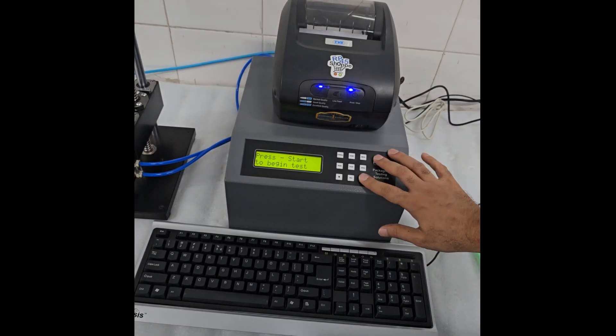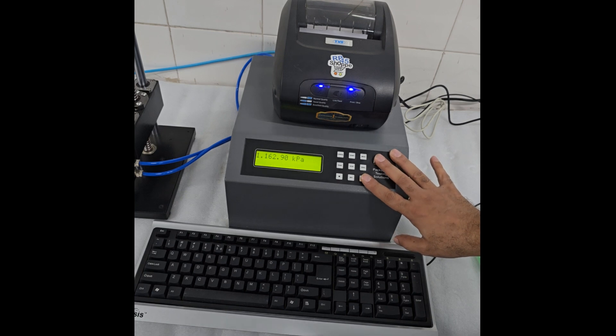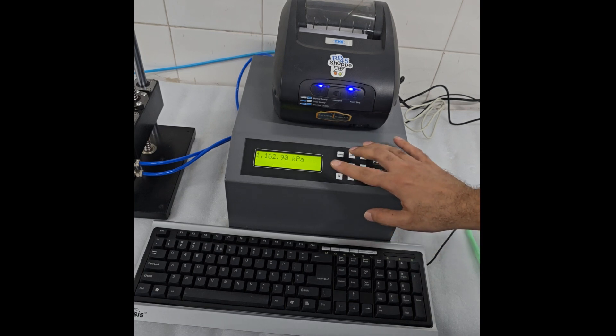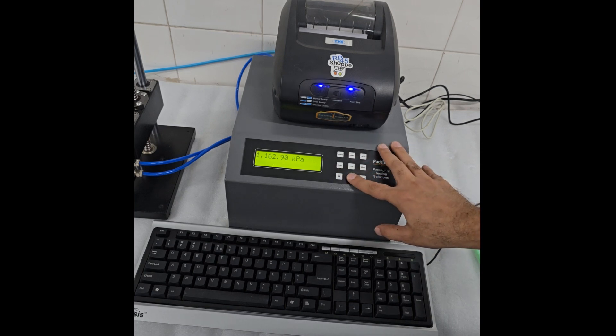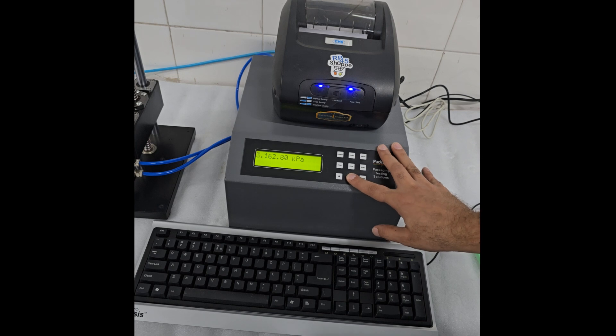Once all samples are tested, press Enter. You will see individual readings. You can scroll through them by using the Start and Reverse keys as Up and Down.